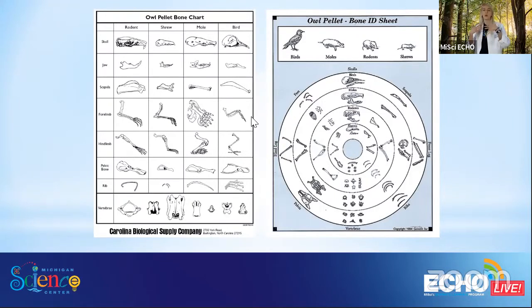They swallow their food, it goes right to their crop, where it then absorbs all of the nutrients from these organisms. So we said it doesn't eat plants. Owls only eat other animals like rodents or shrews, moles, or smaller birds. And then when it's done digesting everything that gives the owl energy, all that's left over is those indigestible pieces, things like bones and fur and skin and cartilage, all that kind of stuff that doesn't necessarily have nutritional value, which is what we are going to be dissecting from the owl pellet today.